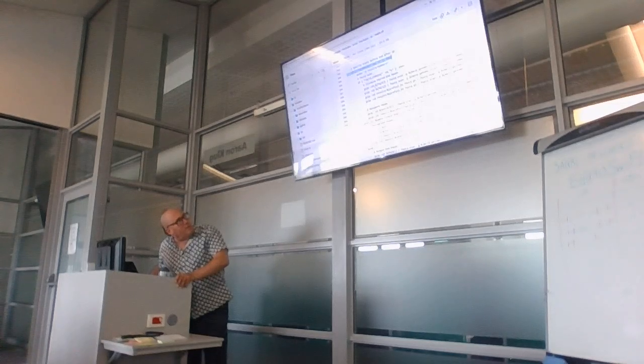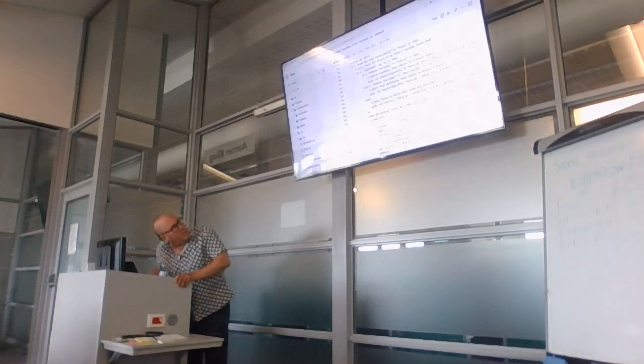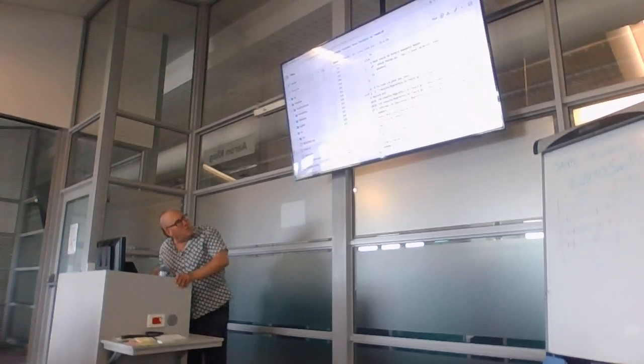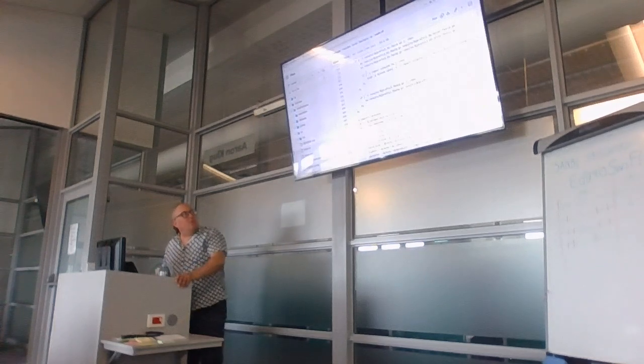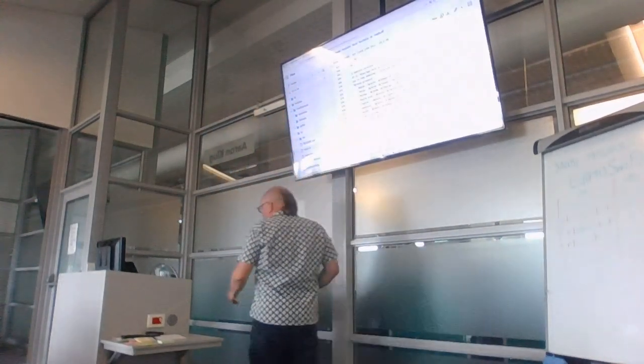And finally, it does some quality stats before and after QC, using FastQC, NanoPlot if we are doing nanopore. And then there's a final QC check, and I can't see what it's doing here. I think it's doing some other stuff. And I'm not going to read through all of that. But my point is that this is a long, complicated script. But without having to read every bit of it, you can see that quality control for nanopore is this thing called NanoQ. For Illumina, it's either BBDuk if you've enabled that, or fastp. And then it will do this thing, and then it will end. Okay?